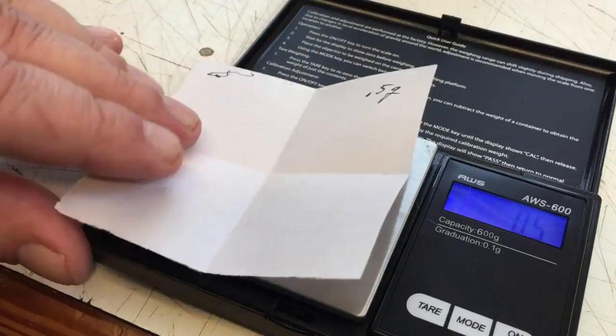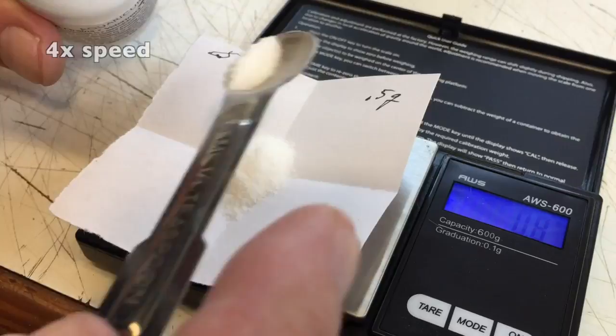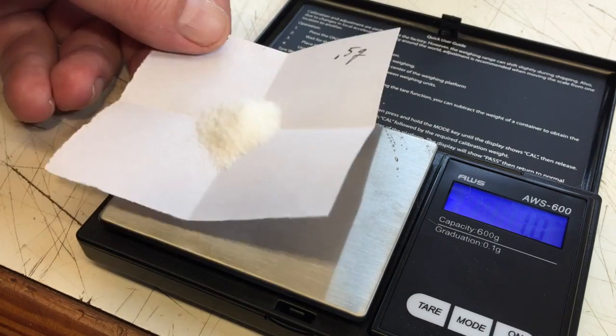I press the tare button — really it's a zeroing button — so whatever I weigh now won't take into account the piece of paper. I'm going to measure out one gram of ivermectin. Okay, it says exactly 1.0 grams. I'll set aside my ivermectin.